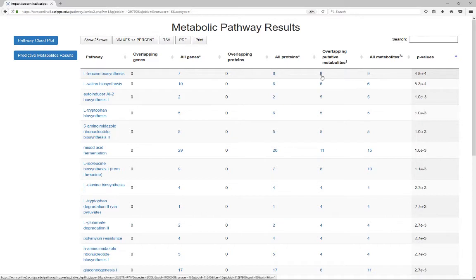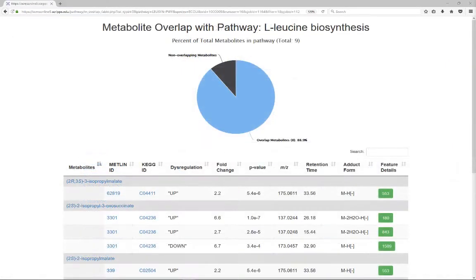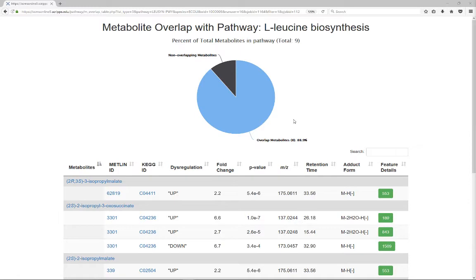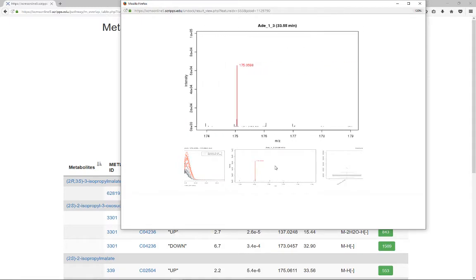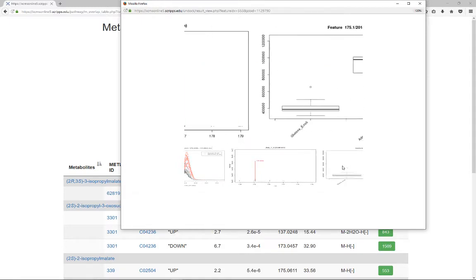For instance, clicking the number of overlapping putative metabolites opens a page of detailed information about the involved dysregulated metabolites. Click the feature detail to open another window that displays the LC chromatogram, MS spectrum, and box and whisker plot of that metabolic feature.